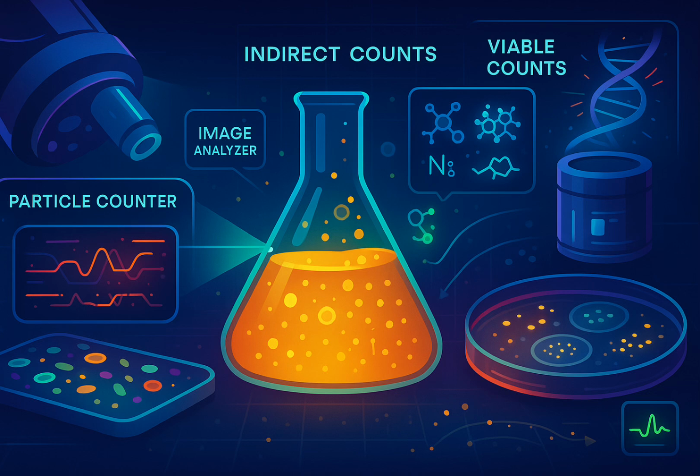Let's shift gears. Viable counts. Now, we only want the living, active ones. That feels different. It is. Now, the method needs to tell you something about the cell's state. Can it divide? Is it respiring? Membrane intact? First one listed, most probable number, MPN.